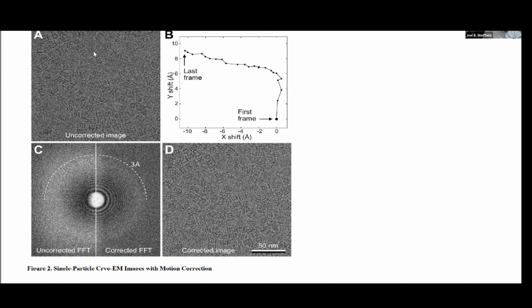So now you could take a stack of this set of movies, the individual frames. So we have frame one, we then have the next one, and then we have the next one, okay? Which are different stages of time, that is, with slightly different movement in them.